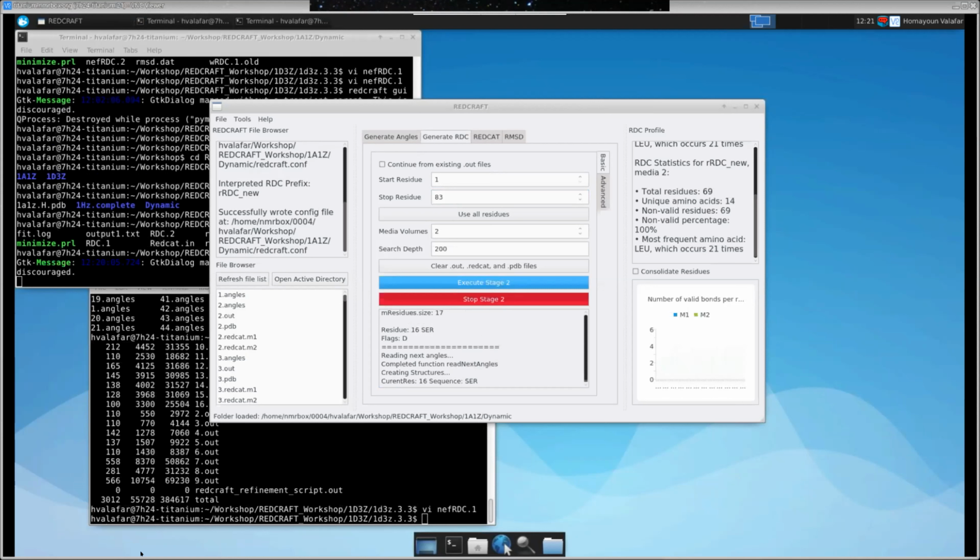Okay, so you can see that it is more taxing. It's calculating a lot. Part of it is because I do not have J couplings in this particular data set, so it's a more extensive calculation. I can study the health of my folding at this point by looking at the latest .out file.